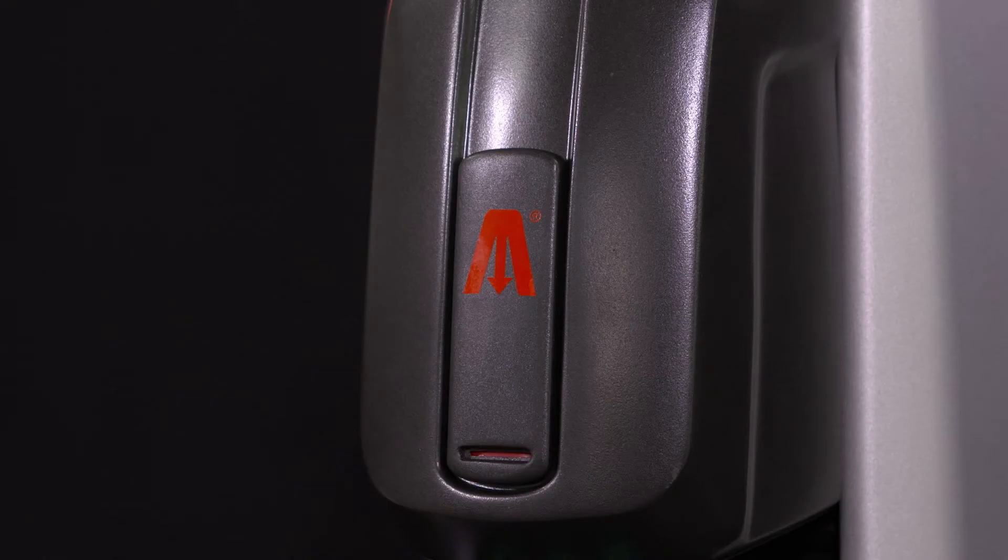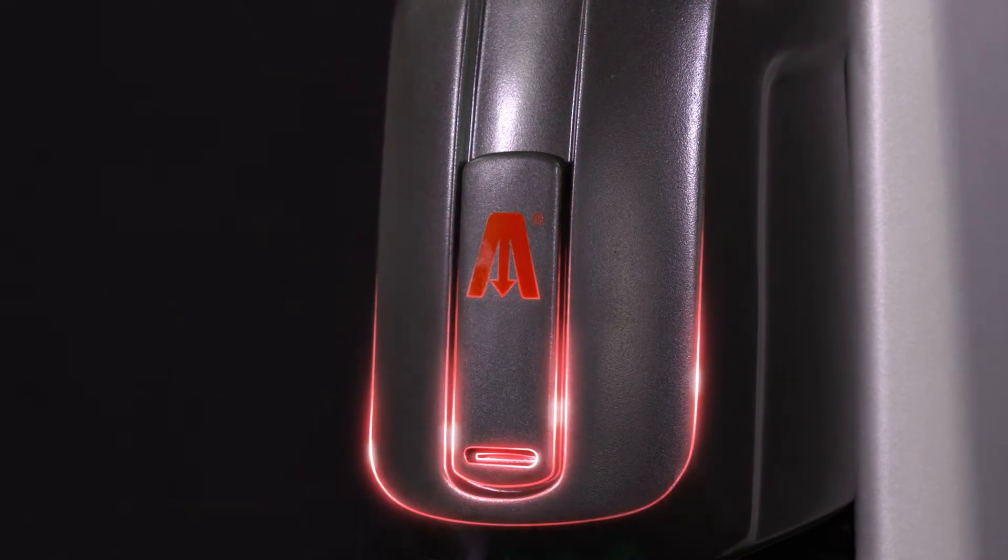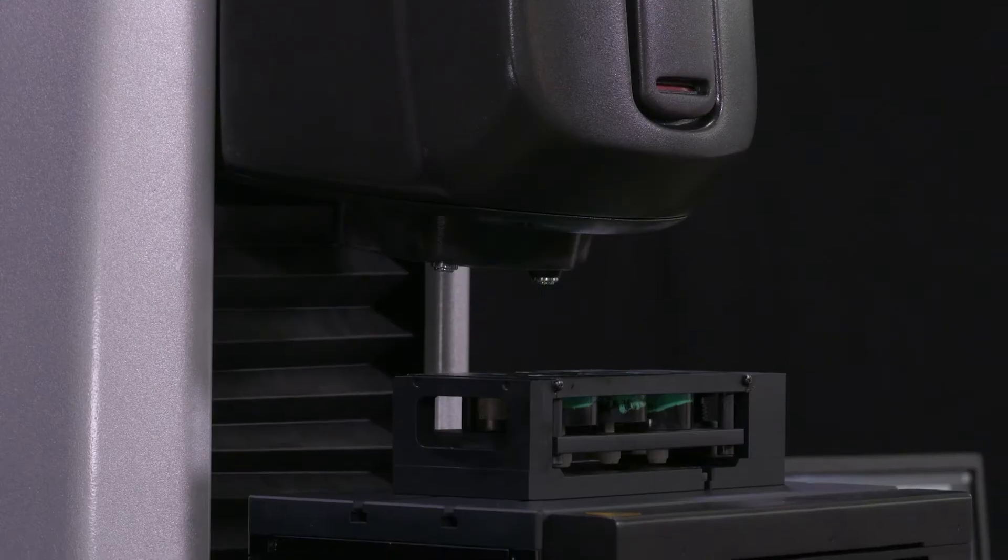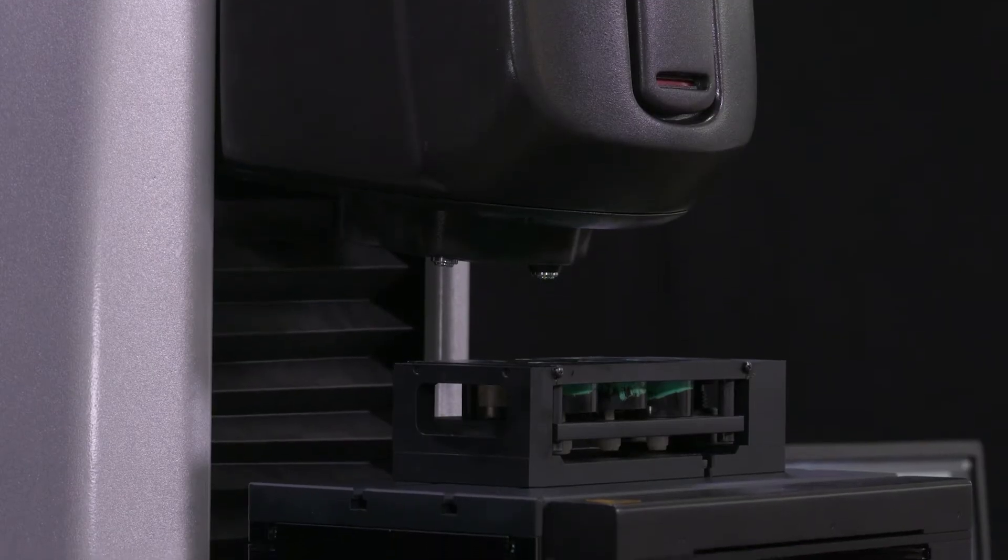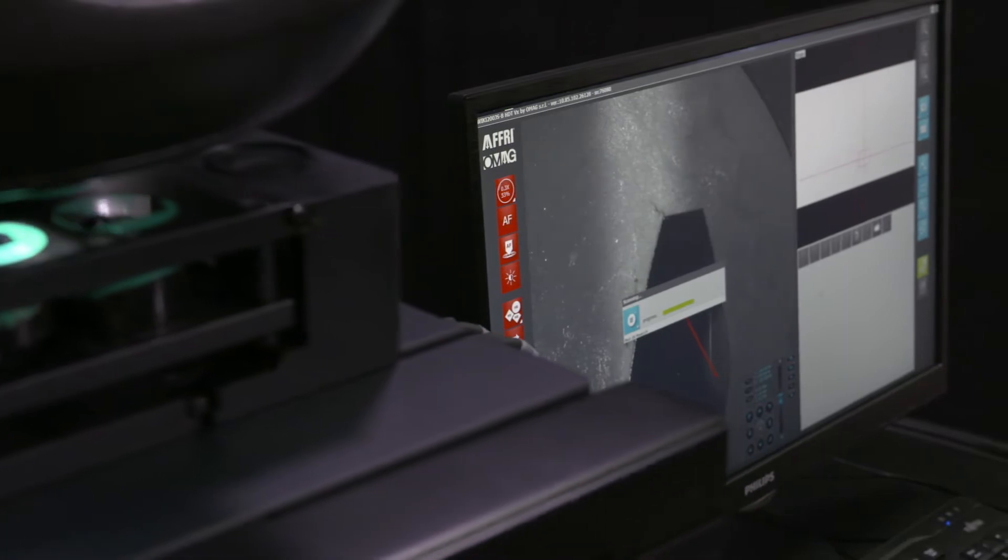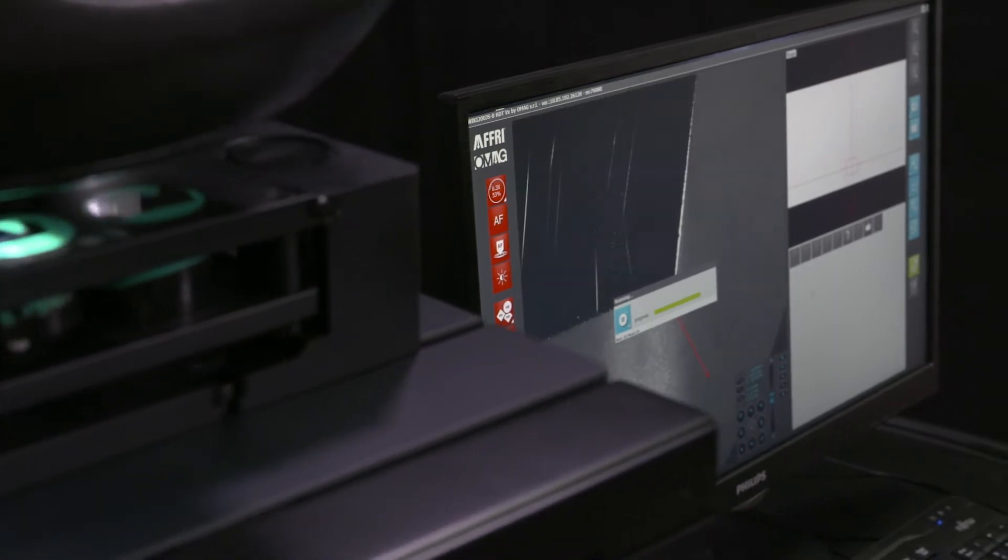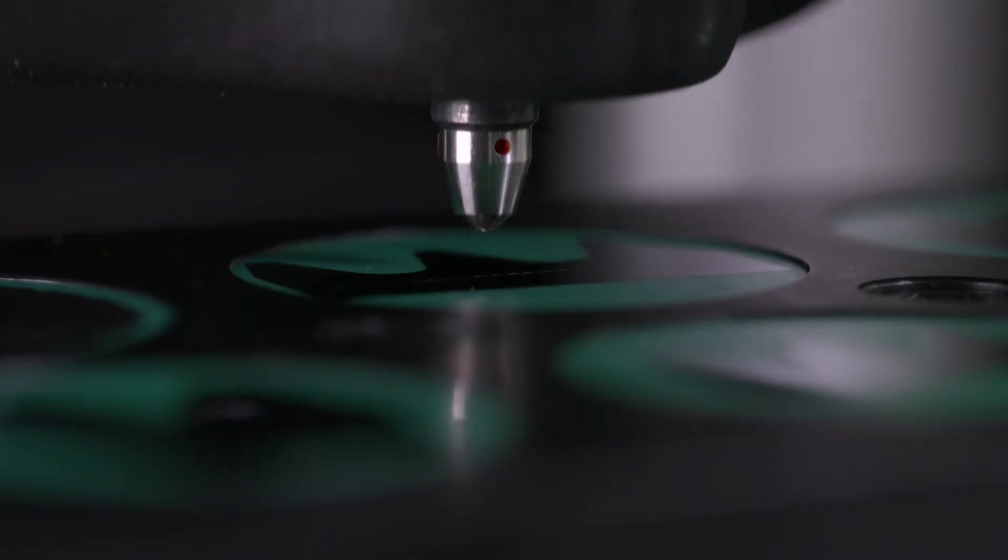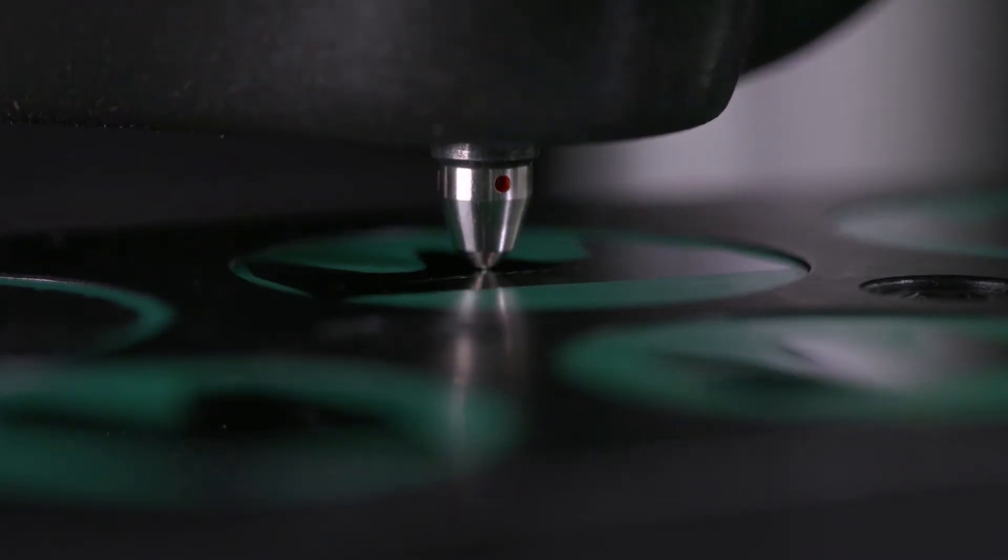The motorized hardness tester is used for automatic measurement of CHD for carburizing, nitriding, and surface heat treatments.